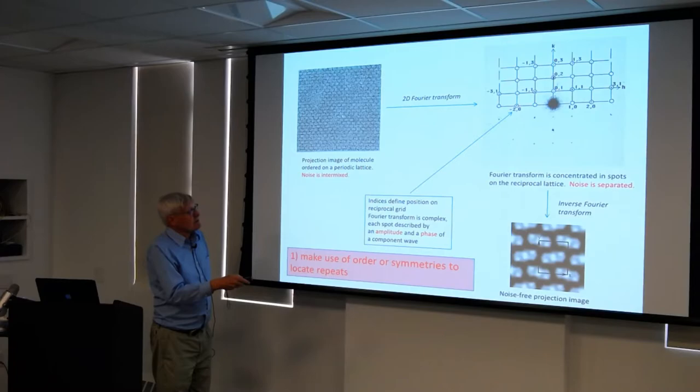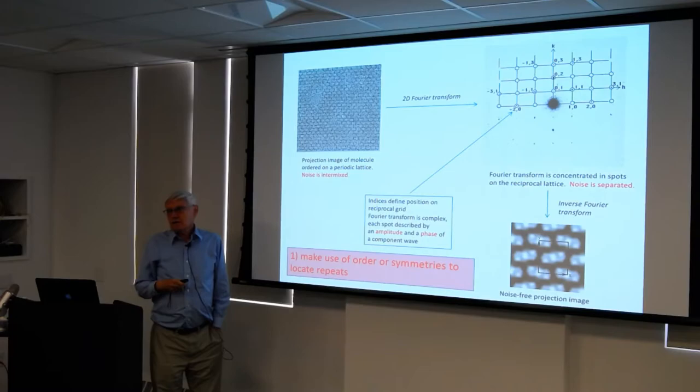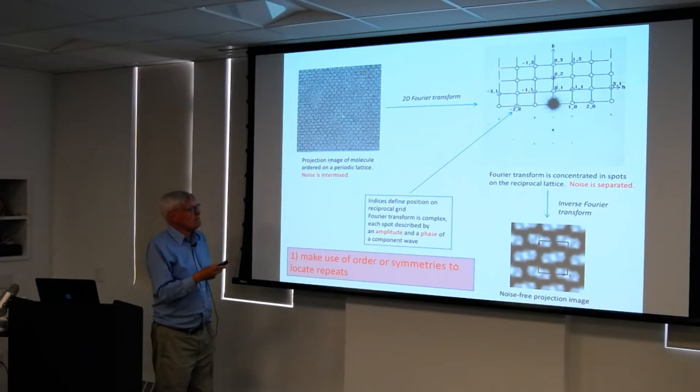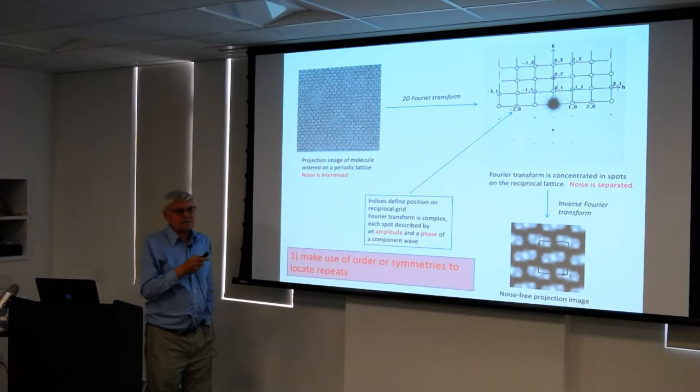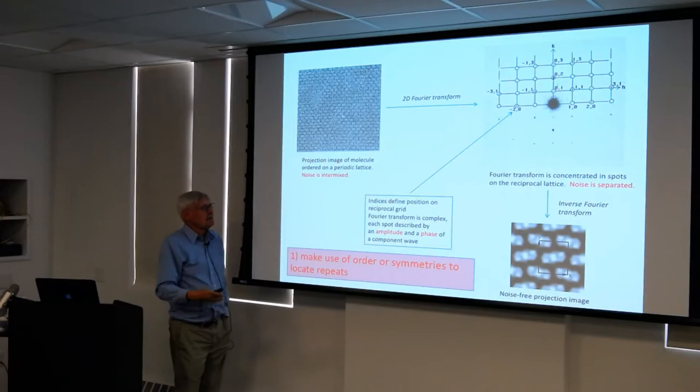And so in comparison with X-ray crystallography, electron microscopes are, my mentor called them, diffractometers that are sensitive to phases as well. Okay. In other words, electron microscopes can produce images. X-ray crystallography cannot produce images. It requires an extra amount of work in order to recover the phases.